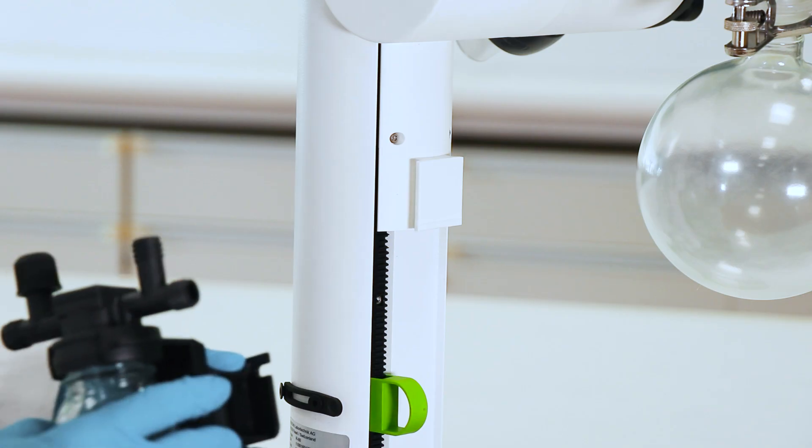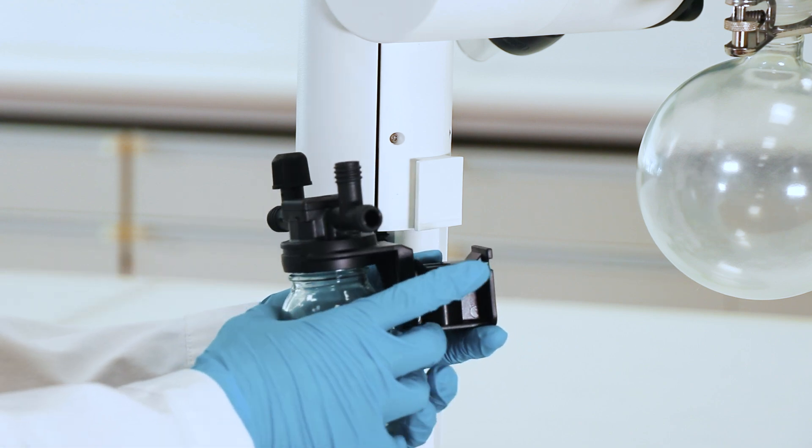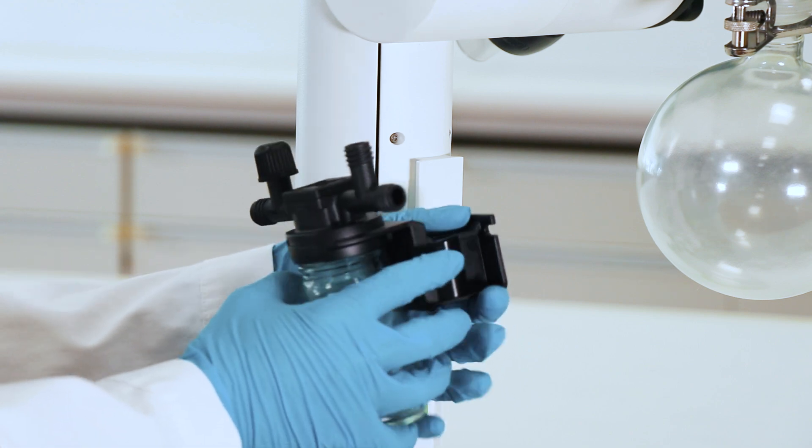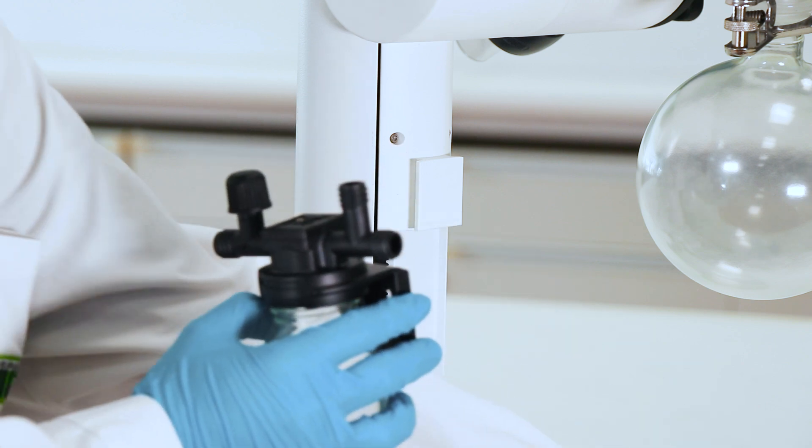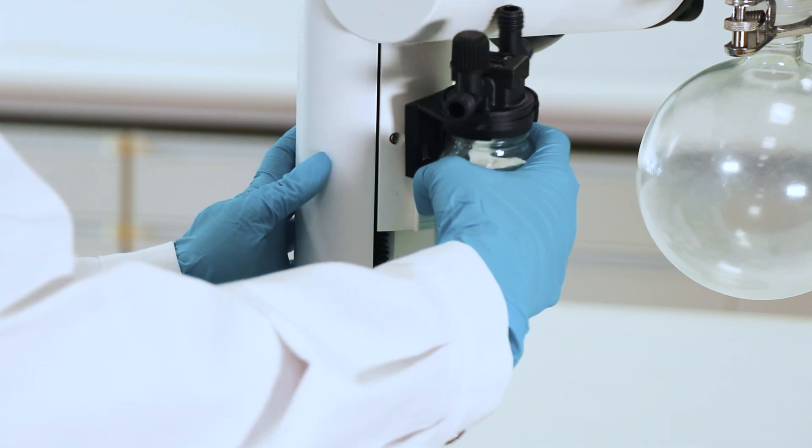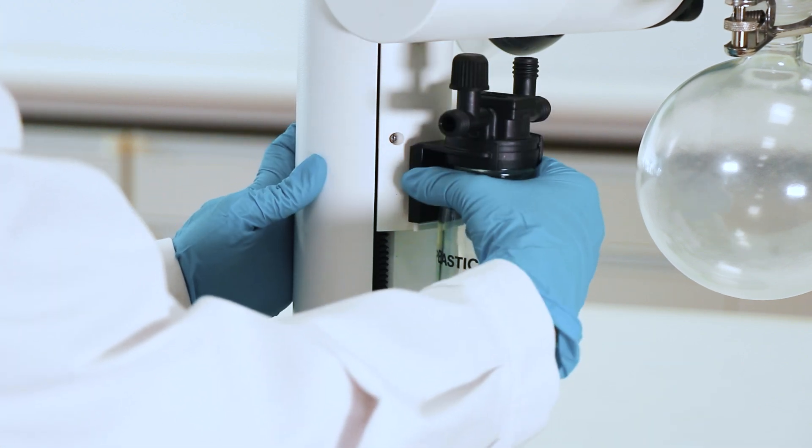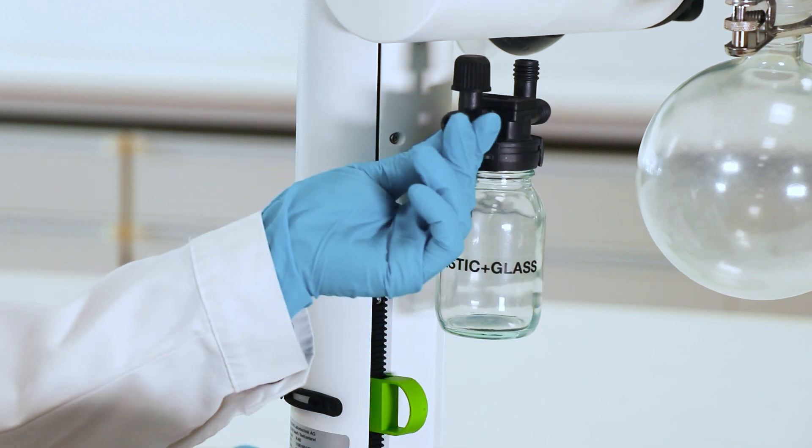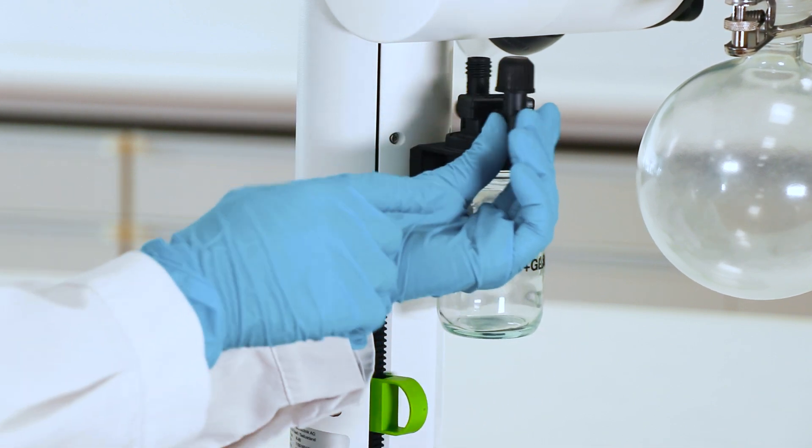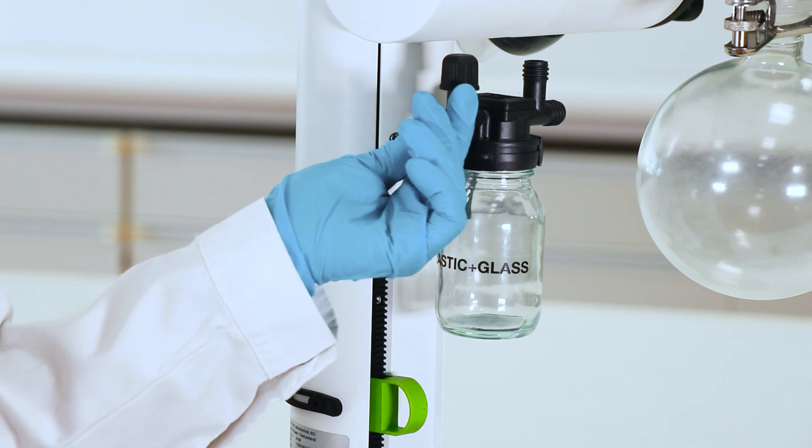So now we're going to mount the wolf bottle onto here. This piece we don't need. That's only if we mounted it onto the vacuum pump. Just take this. And make sure that the pump, it says pump here, faces towards your vacuum pump.